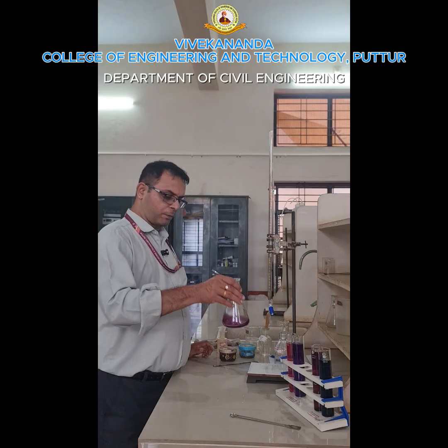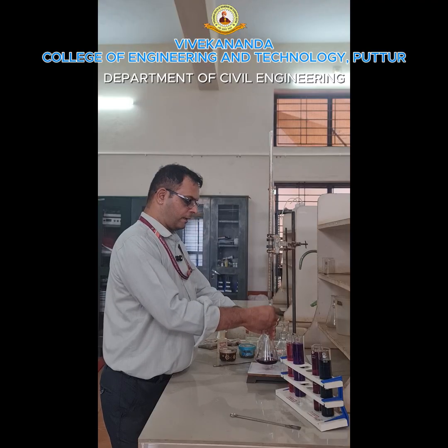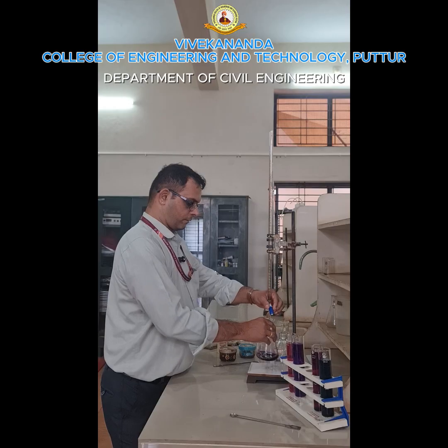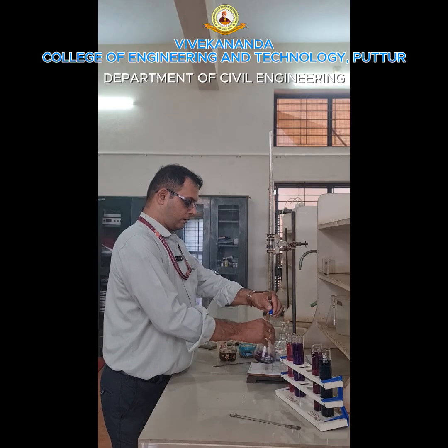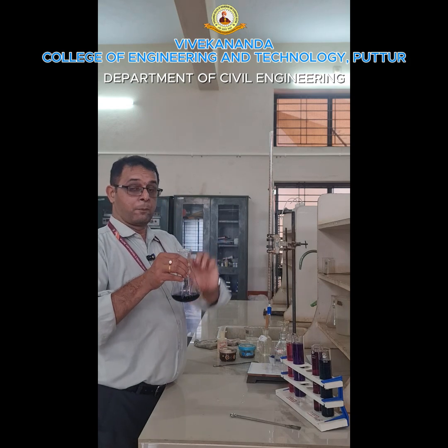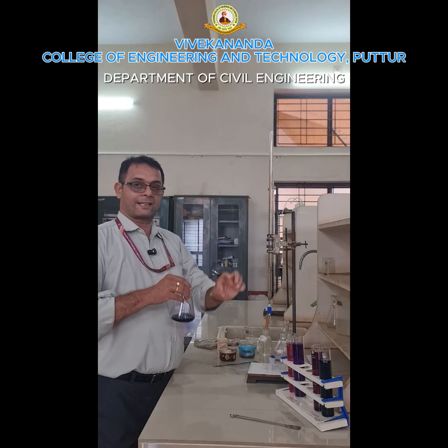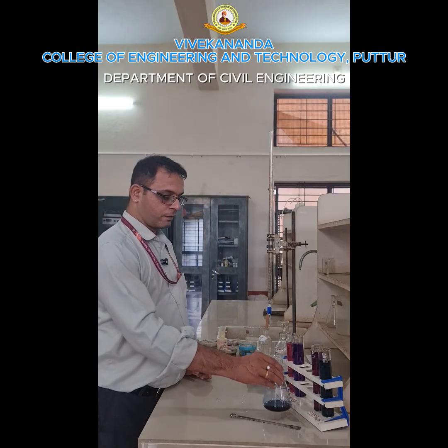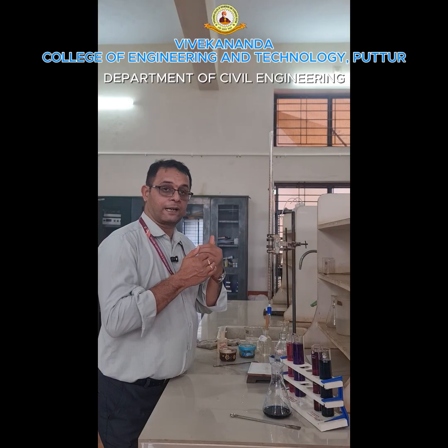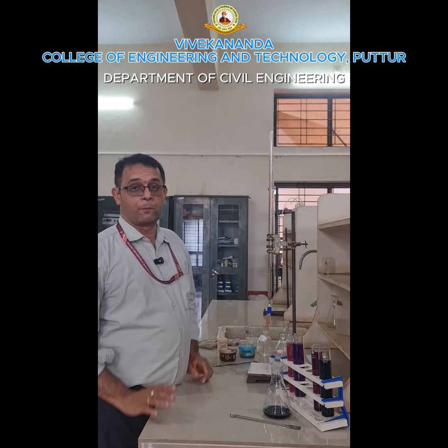Same procedure. Initial color, you have to note down. Then you have to go for the titration. One thing you should be very, very careful. Now the end point is the amount of EDTA consumed will be less because the permanent hardness will be there. Temporary hardness will be removed from the water when you are boiling it.